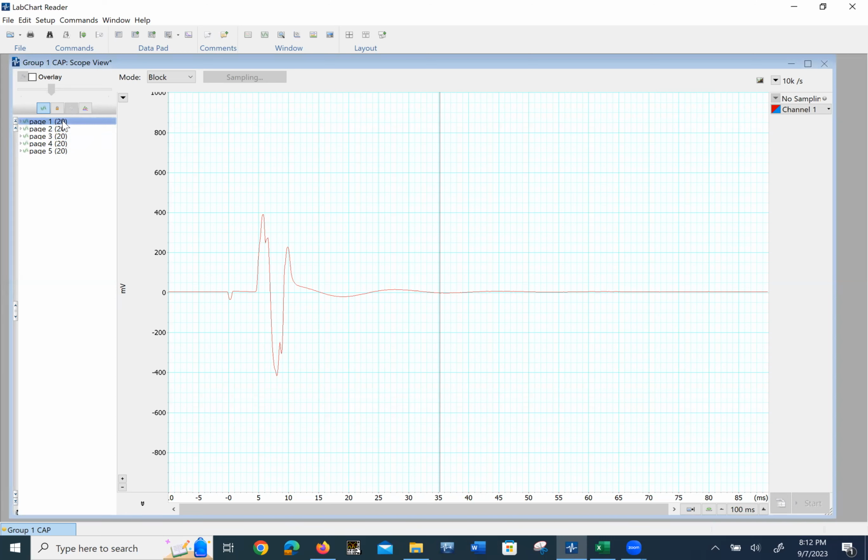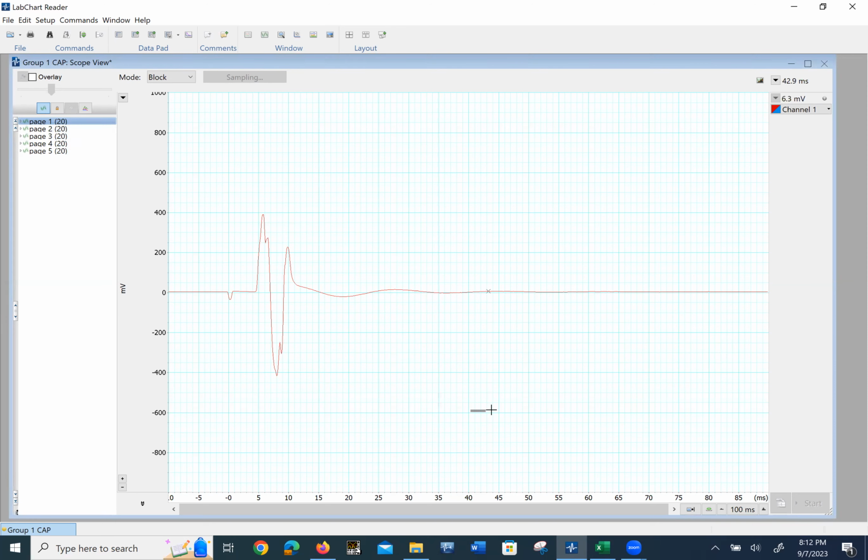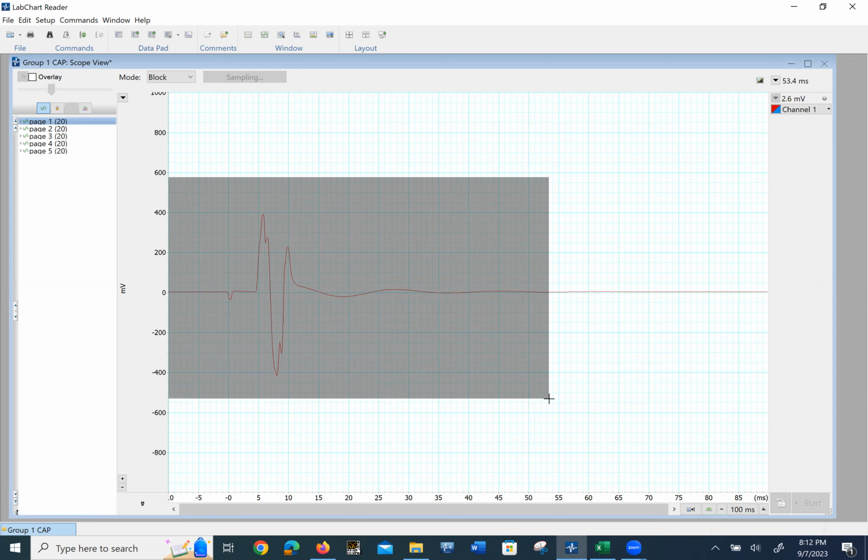So you take your average, like this one, and what you can do is to highlight it. Try to get to the edge of the trace, because it's going to make it easier later. Sorry, this one didn't work. So, all right, let me do this. There you go. And let's just go to 50. You can see the 50 on the x-axis. So we got that. And now I'm just going to go Control C. So I copied that screen.